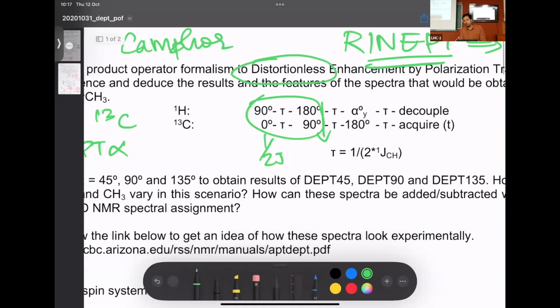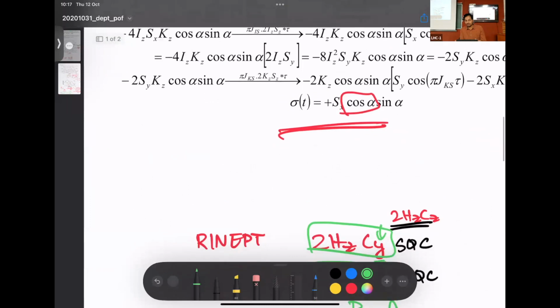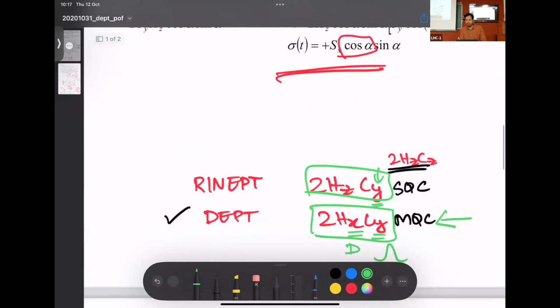Yeah, that's a good question. The question being raised is that we are compromising broadening for distortions. So his question is whether the broadening is less than the distortions that you get with phase. Both lose resolution. Dispersive terms reduce resolution, relaxation reduces resolution, right? In this case, for small molecules, the broadening is slight, but it's not much. I'll show it to you. Once you see the spectrum, you'll be able to appreciate it far better.